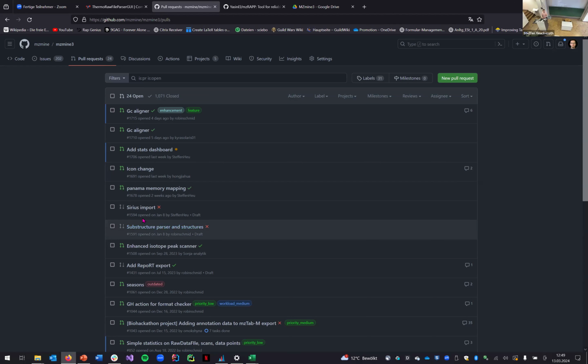As you can see, we are currently working on MZmine a lot. We are trying to add some simple statistics. We are trying to import results from Sirius. So it's not a dead software. We are actively improving it all the time.